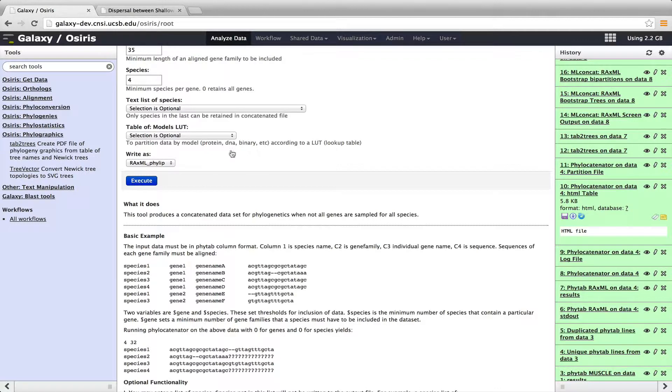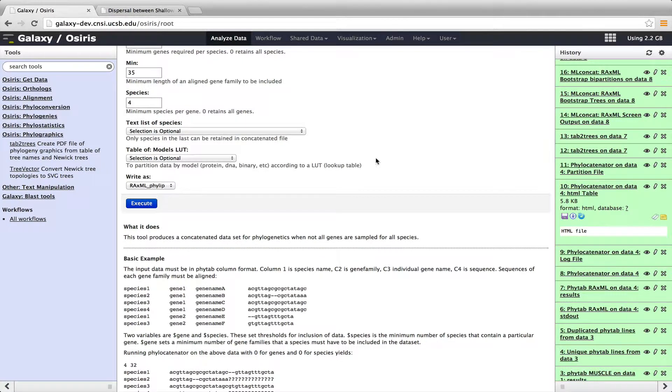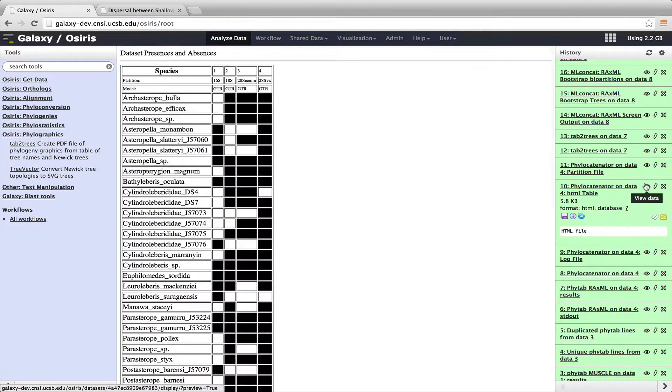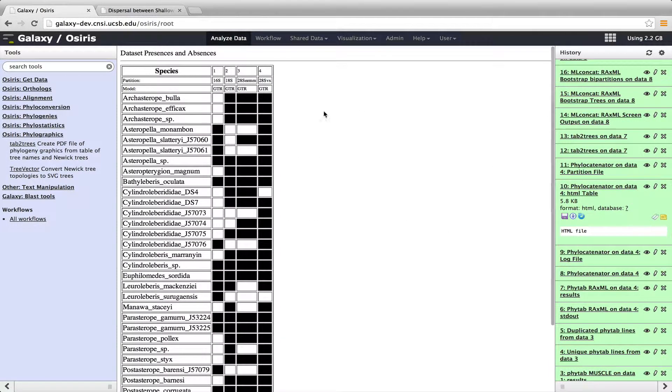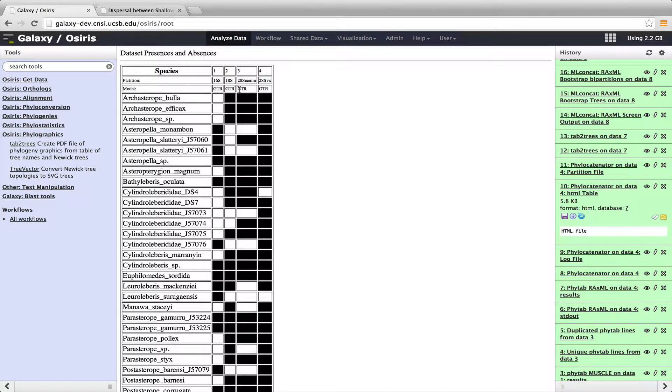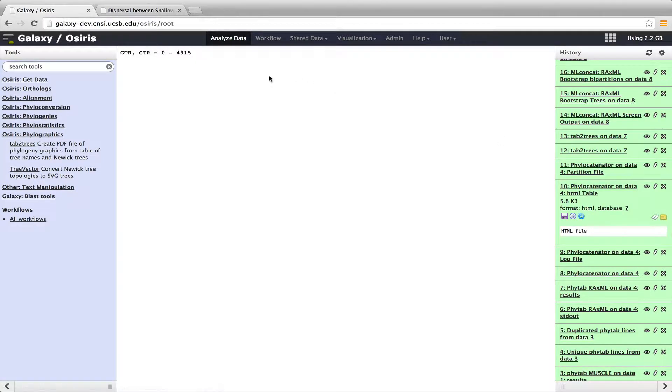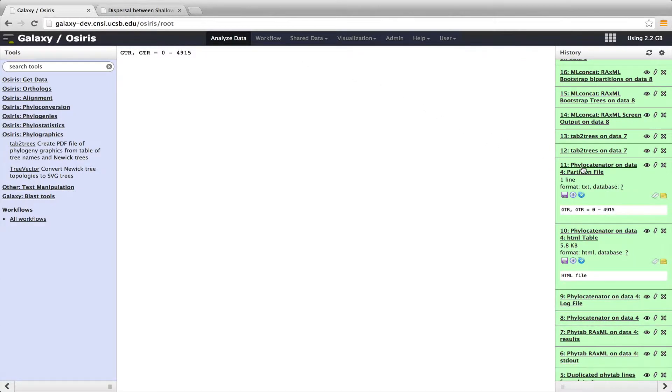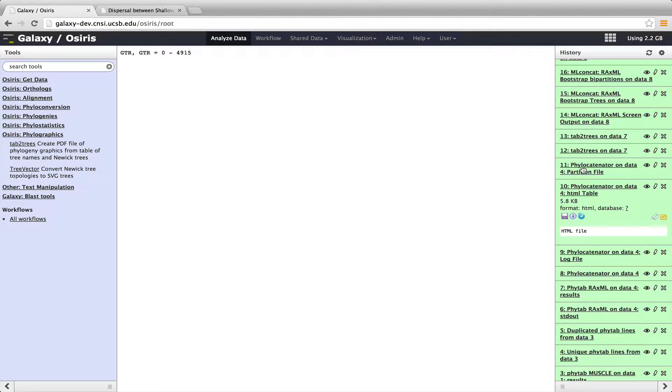We can also generate a different model for the different gene partitions. And this is also explained down here in the help. But we can use a different model for each of our gene partitions. So this allows us to use mixed data types, proteins, DNA, even morphological data. So the way that I ran the tool here, I didn't use separate models. And so what that results in, as you can see on that HTML table that I showed you, is that the default then is the GTR model. So each of these specifies in the partition file a GTR model. And so you can see here, this is our partition file, which if we had different data types would be illustrated here, but we just have the one different data type, which is DNA in the GTR model. So that's phylocatenator.